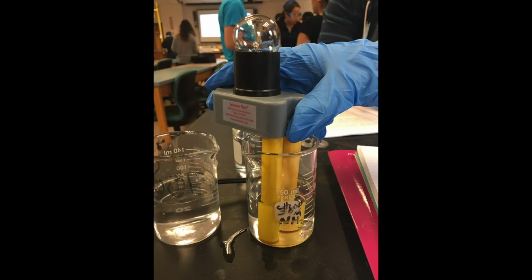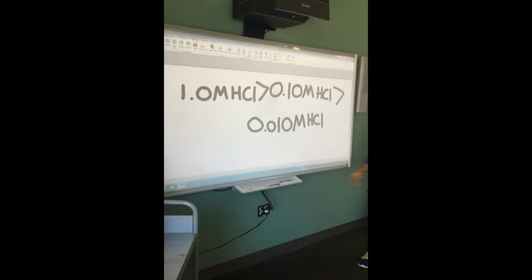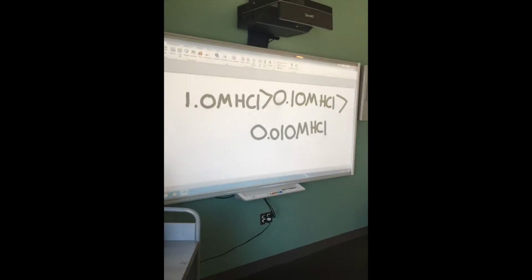This process diluted the HCl sample so that we could determine which concentrated solution produced the most light with the conductivity tester. We used the previous sample from Part A to do our comparison. With these 3 samples, we could rank them from brightest to dimmest. In Part B, we gathered in order from brightest to gradually decreasing darkness that the hydrochloric acid was brightest at 1 molarity, moderately bright at 0.10 molarity, and almost indistinguishable with barely any brightness at 0.01 molarity.